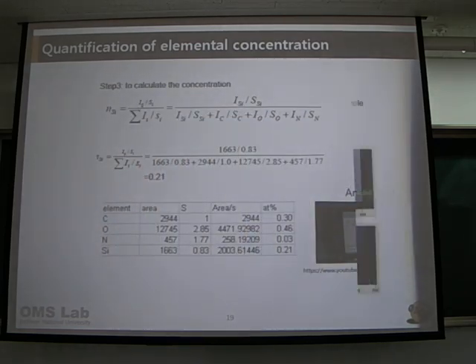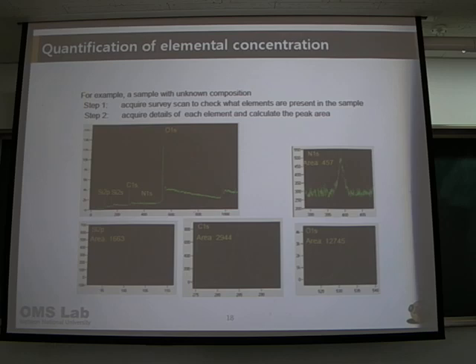How do you know which electron was ejected? 1s, 2p. How do you differentiate? If you scan, this is the first machine scan. If you want to scan the 2s, 2p, then maybe, as I heard, but I don't know exactly, we have to scan more. Because it is like NMR. Like NMR, depending on your structure, each chemical shift is already known. But of course, it will vary depending on the environment.